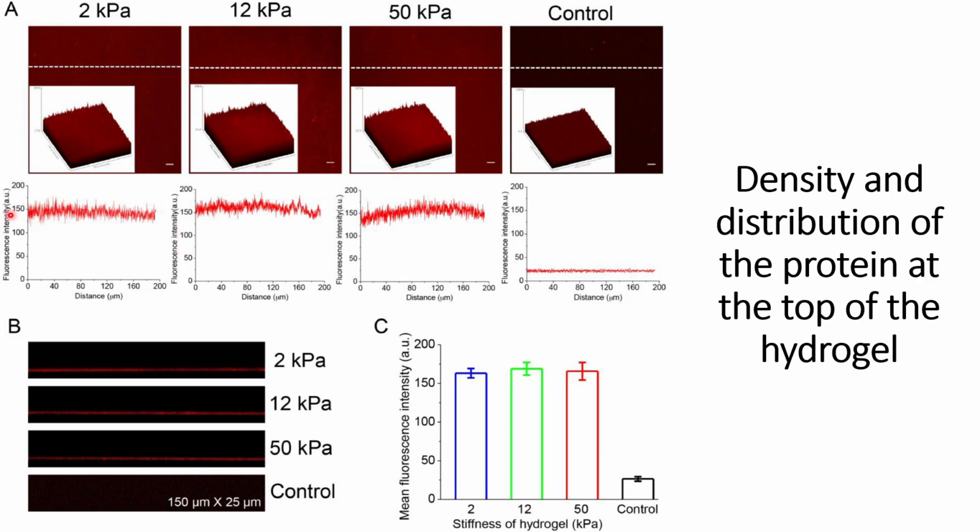And when they did their confocal microscopy, they could see that the fluorescence intensity is the same across the different stiffnesses of the hydrogels. And for the control where they do not use streptavidin, the fluorescence intensity is minimal. So this indicates that the interaction they are expecting, that is biotinylated anti-CD3 interacting with PE anti-IgG, seems to be correct, and the interactions are specific rather than non-specific, because the control does not give fluorescence signals at a higher value.